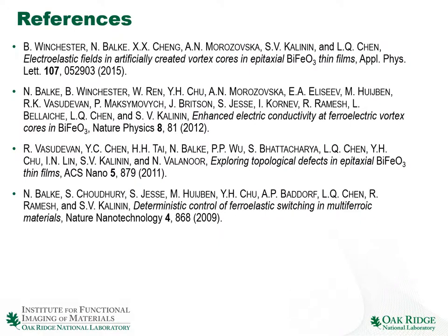These results are discussed in this series of papers. Starting from Nina Balke's paper in 2009, showing the deterministic control of ferroelastic switching, and Rama's paper on exploring topological defects in bismuth ferrite, and another paper exploring the electric conductivity in the ferroelectric vortex core. Here we have shown that the central part of this vortex forms essentially a conductive channel through the material. Additional studies of the fields in the vortex are reported in the paper by Ben Winchester and Long-Qing Chen.